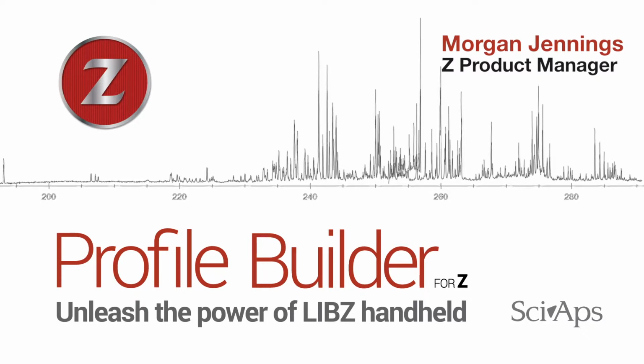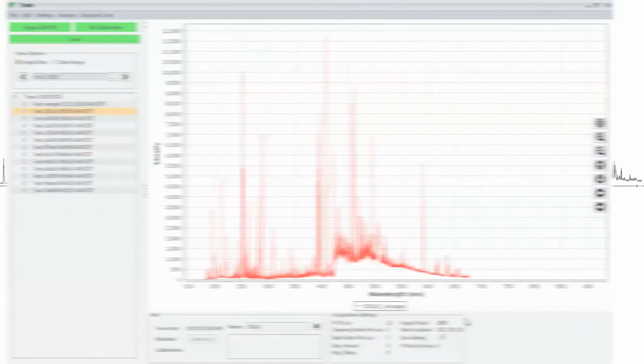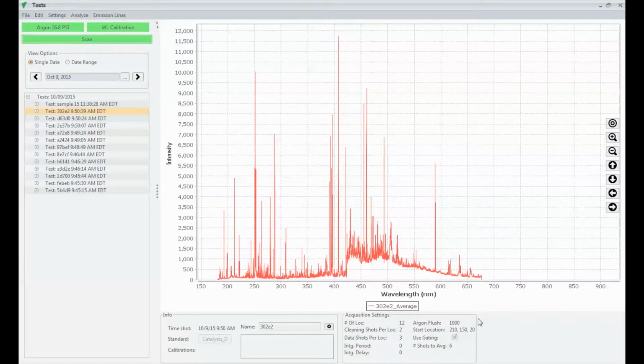Today we'll be talking about our Profile Builder PC software, which accompanies our LIBS model instruments. The great thing about this software is it turns our normal portable elemental analyzer into a powerful scientific desktop instrument. Basically, with LIBS, you're able to take it into the field and get in situ results, but when you combine it with this PC software, you gain the functionality of a normal benchtop high-end instrument.